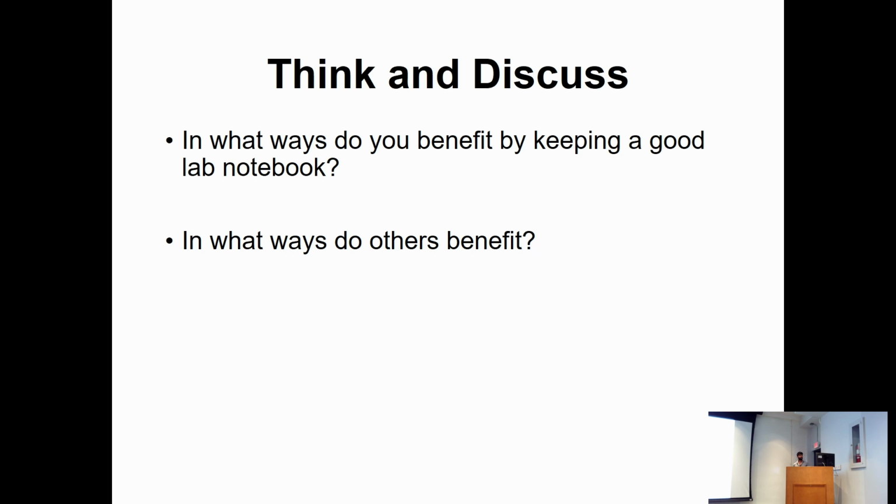I'd like to give you a couple of minutes to think and discuss: in what ways do you benefit by keeping a good lab notebook? Any answers? You can remember and keep track of what you've done, especially if you're doing the same thing for a couple of months or even a year, so you have a log of everything you've already done. Yeah, that's a good answer.